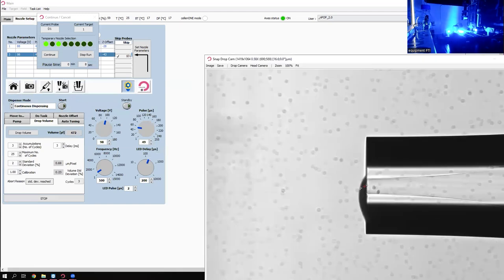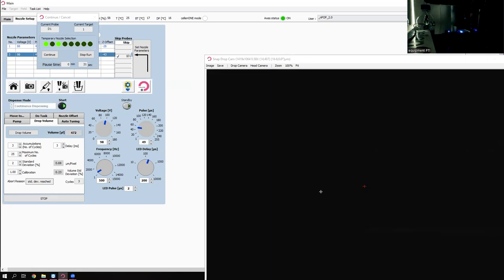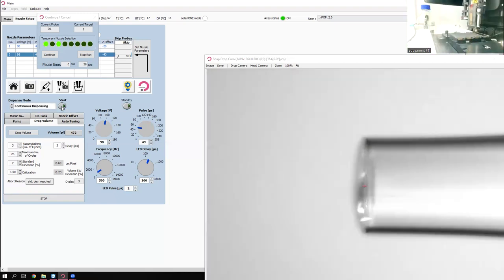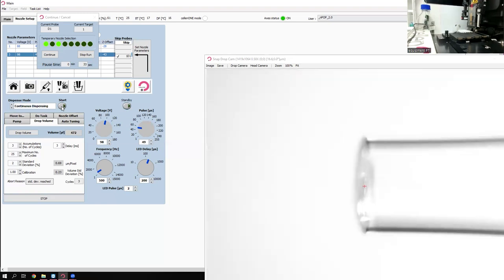There's some DMSO on the outside of the nozzle here. We're going to take a look and see if it is affecting our droplet generation. See a little bit of a wavering there. There's a conditioning period that happens as DMSO replaces water at the interface. We might do a quick wipe with our kit, just to get rid of that DMSO.